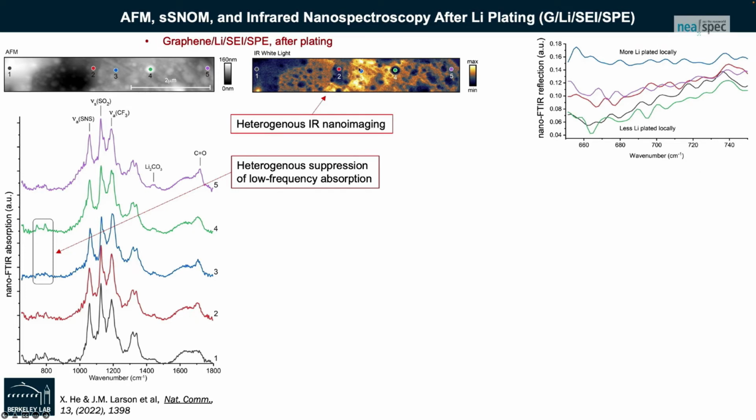And so just think in the limit of infinite lithium, right, you're not going to have any DC absorption signals. They're all going to be screened out, right? But if you have no or little lithium, then the DC signal probably won't be screened out as much. Or by DC, I'm saying the lower frequencies. And so that's exactly what we find. And actually, there was a linear correlation between those that you can see in the paper. And it's also seen in the Nano-FTIR reflection.